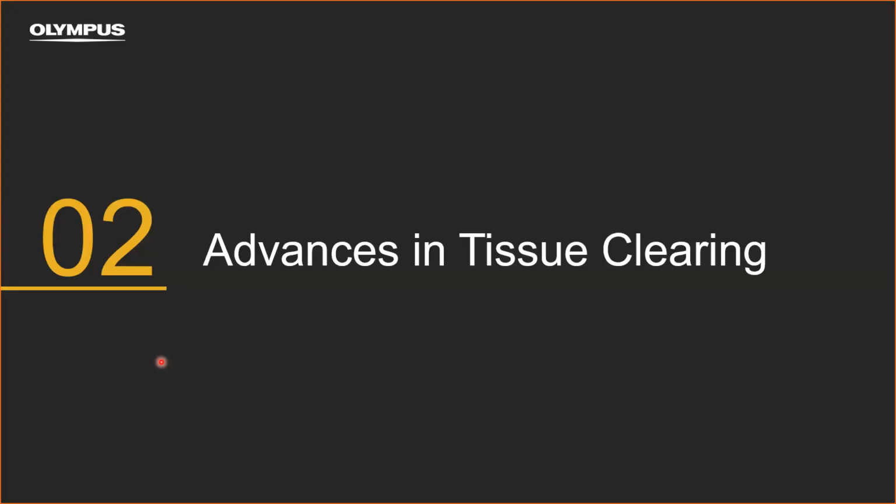There are many protocols for clearing different types of samples. New and complete systems are now available to help researchers produce reproducible clear tissue samples for imaging. Now, Tim will discuss the X Clarity system as well as considerations for tissue clearing.